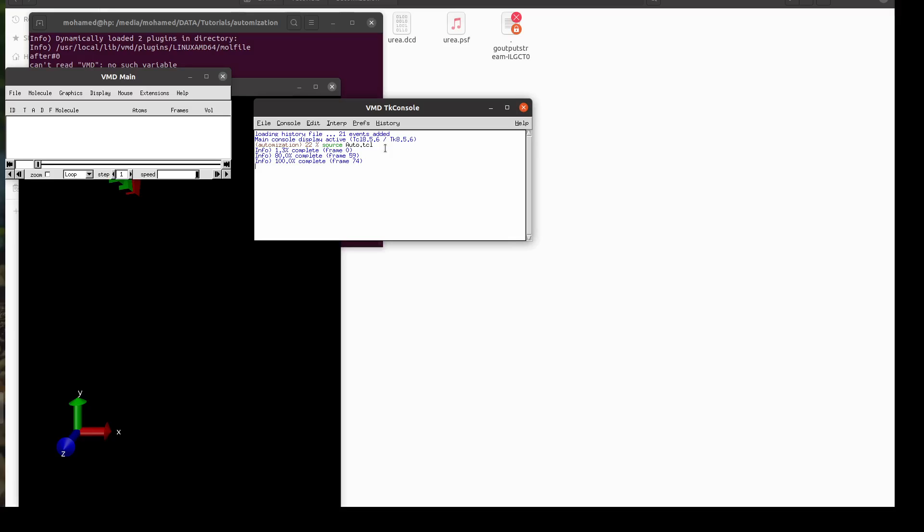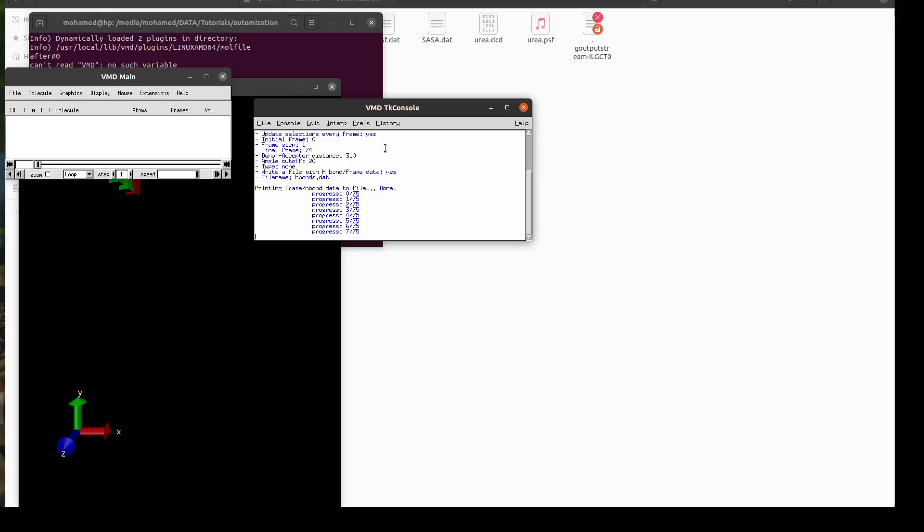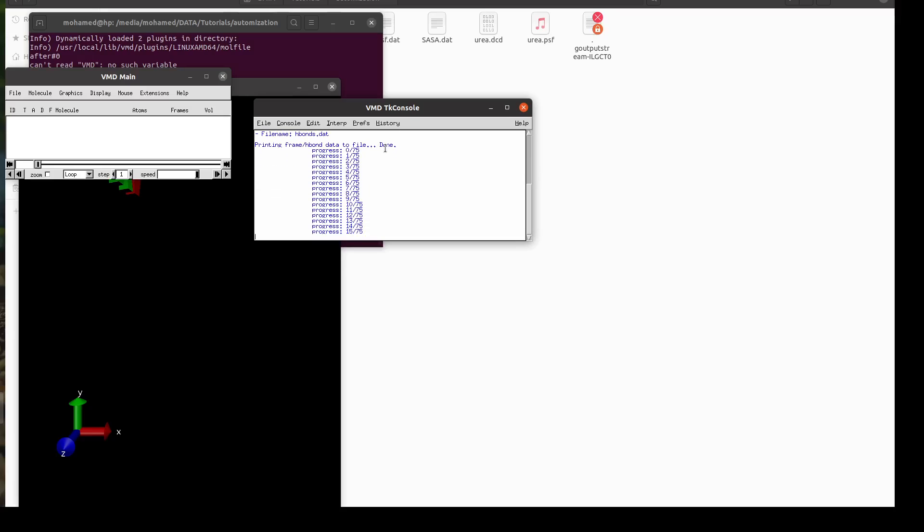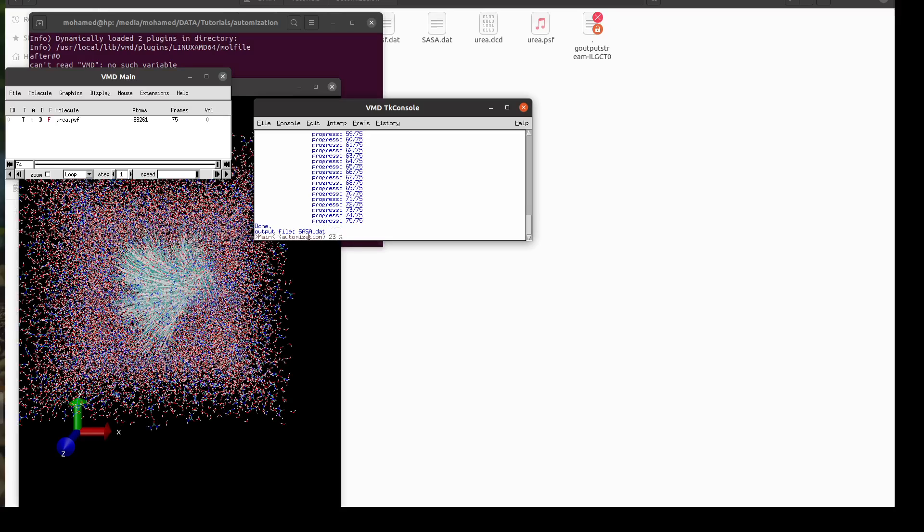And of course this is a very short trajectory so it will take some time. Imagine if you have like 10,000 frames, that's why automation is very good so you can source your script and go for lunch or go for reading a paper or do whatever you want. So now it is giving you the progress in SASA as I said by n. When it reads n by n which is 75 by 75 it will say done and this is your output file.